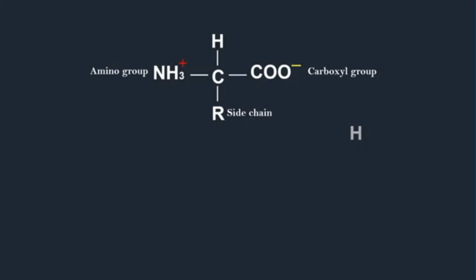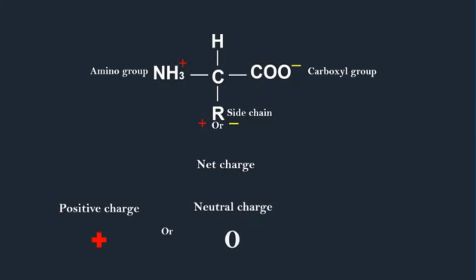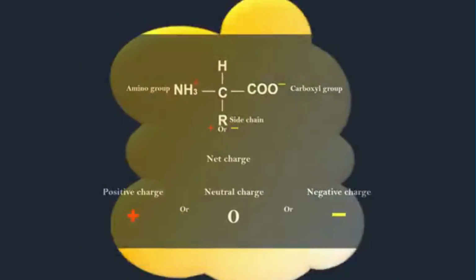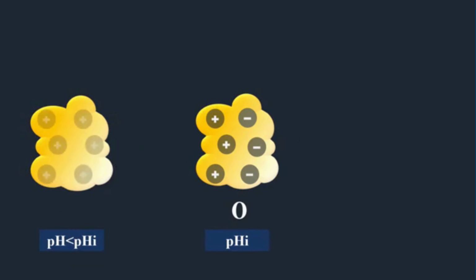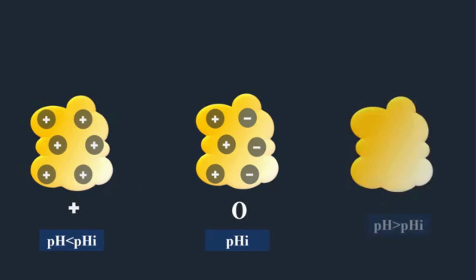Metallurgy and environmental chemistry: selective recovery or removal of metal ions and radionuclides. Ion chromatography: determination of trace ionic species using conductivity, UV, electrochemical or mass spectrometric detection. IEX coupled with MS has become increasingly useful for complex environmental, biological, and pharmaceutical samples.